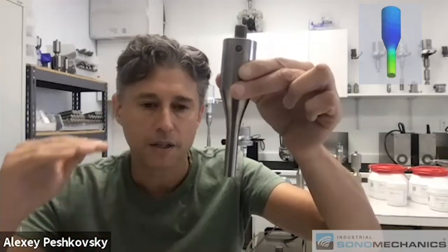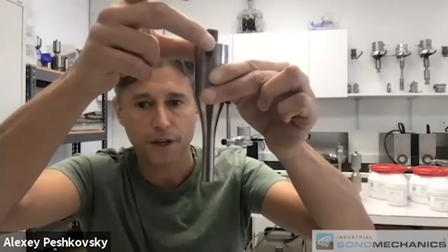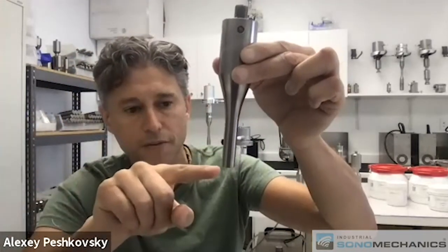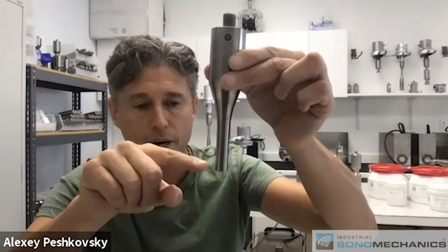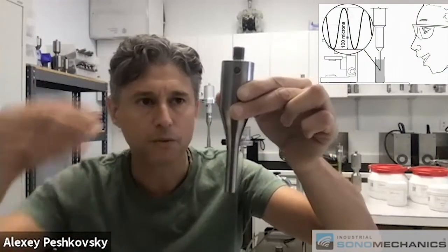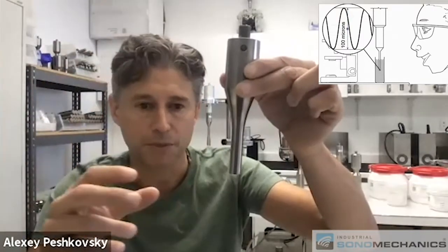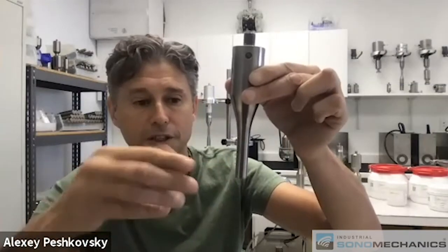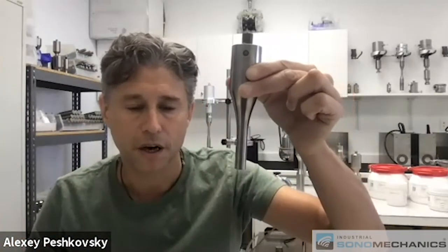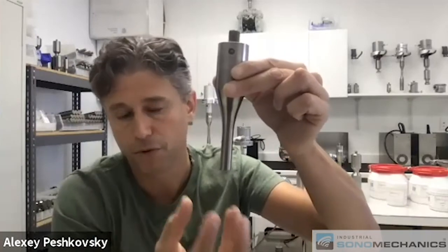70 microns is considered reasonably high; typically 100 is very high. In order for this to happen, this type of horn goes through a shape transformation where the input end is thick and heavy, and then as a result you have a thin tip that vibrates with a much larger amplitude. It's always been believed that's a conservation of momentum-related phenomenon. It amplifies the amplitude of the transducer that's driving it, and ultimately delivers the vibration into the process fluid.